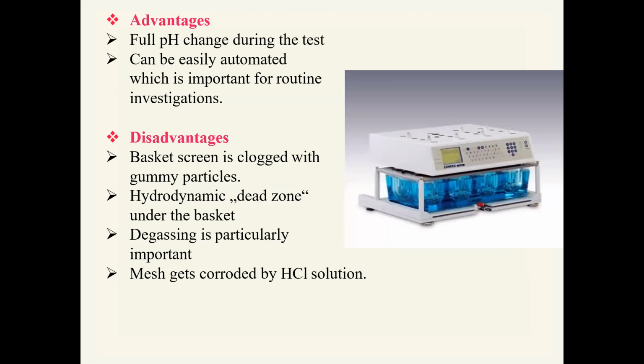Here some advantages are there. Full pH changes during the test, and it can be easily automated, which is important for routine investigations. These are some of the advantages.